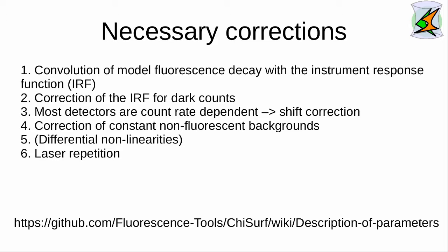Some instruments exhibit differential non-linearities that can be corrected. Moreover, at high repetition rates, the laser repetition rate needs to be considered when convolving the instrument response function with the data. The list of parameters is provided on the web page, as shown here below.